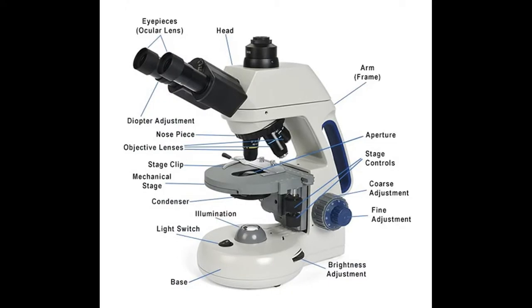In this video, we are going to have a short tutorial on the microscope, the parts and function of the microscope, the types of microscopes, and also the classification methods of microscopes.